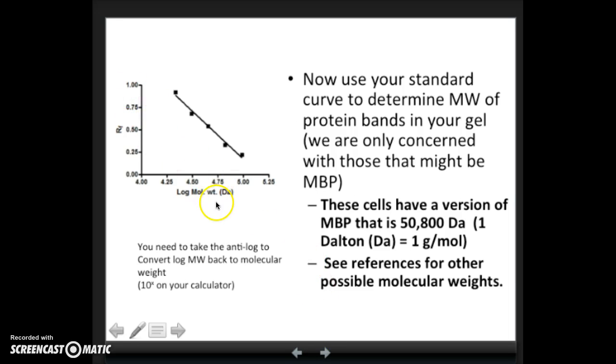Here's what an actual standard curve should look like. Here's our RF versus our log molecular weight. Then we can make a trend line and determine the equation of the trend line. We can use that standard curve to determine the molecular weights of the protein bands in your gel. Remember, we're only interested in those bands that we think might be our maltose binding protein. You don't have to measure every band you see. Pick out ones that you are interested in and measure those. Now you'll have the RF of your unknowns and you can use the equation of this line and determine the log of the molecular weight that's given by this standard curve.